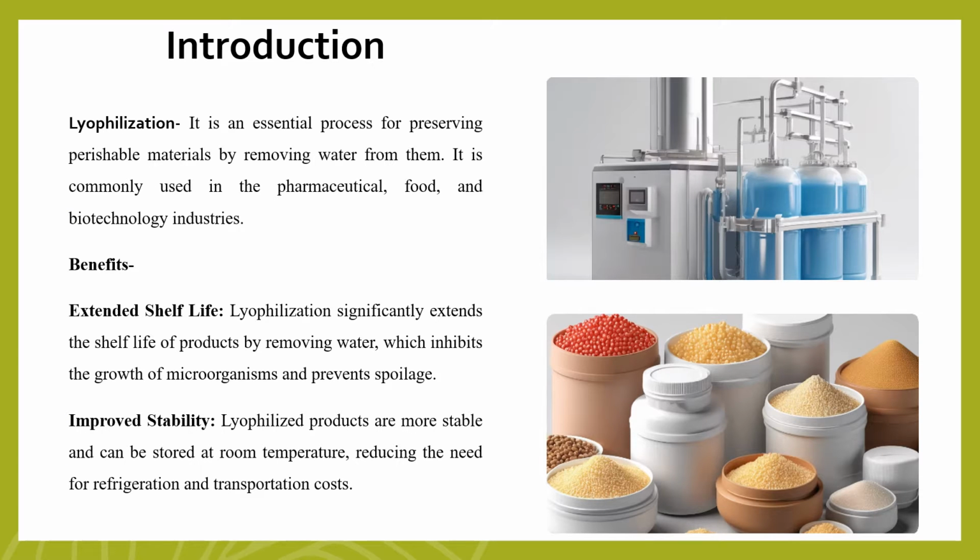Introduction. Lyophilization is an essential process for preserving perishable materials by removing water from them, which is commonly used in pharmaceutical, food and biotechnology industry. Some benefits are extended shelf life and improved stability.